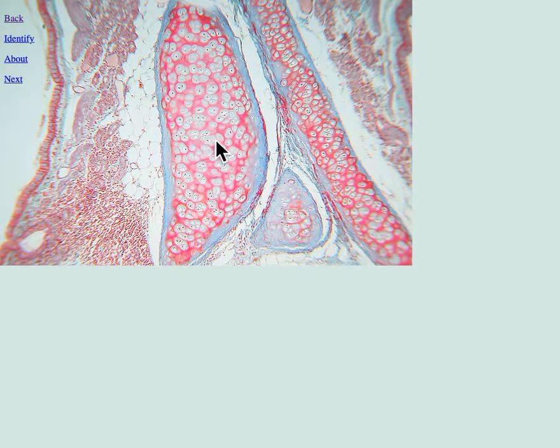You can see some hyaline cartilage here, here, and here. Here's some adipose connective tissue. Really hard for you guys to see this, but there would be a ciliated pseudostratified columnar epithelium. Okay, so let's enlarge it so we can take a good look.